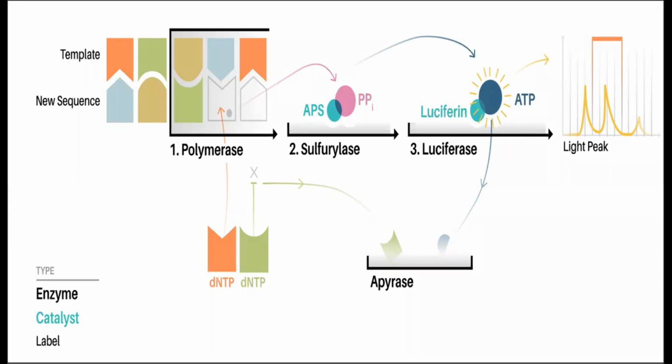Now your genomic DNA is a very complex structure, right? And you can't run that complex structure for your sequence analysis. So the very first thing you do is fragmentize your genomic DNA into small double-stranded DNA molecules. Once your small double-stranded DNA molecules are obtained, you then conjugate them with an adapter molecule. The reason we are going for an adapter molecule is that the adapter molecule will allow the polymerase to identify your DNA of interest, and then you can go for your processing or DNA sequencing further down the road, right?